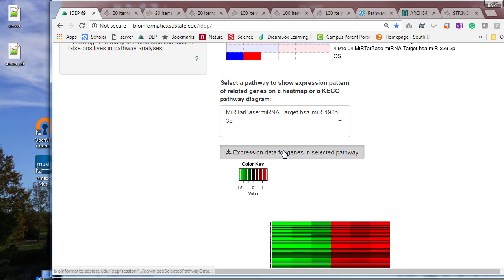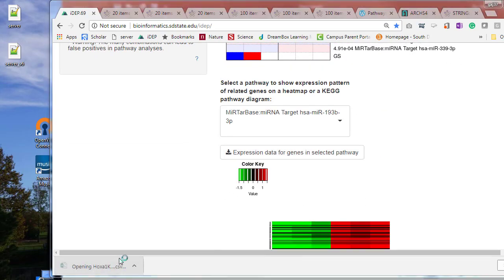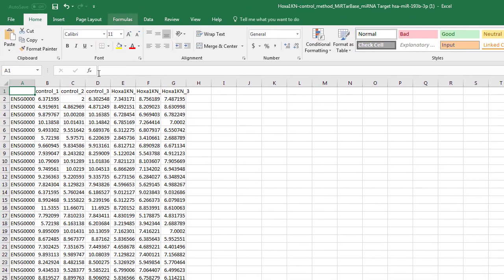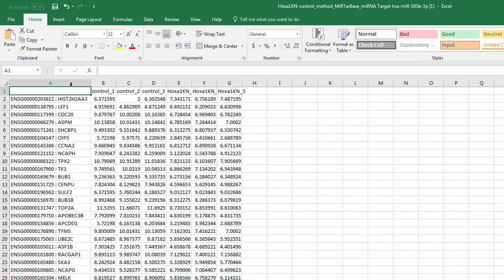If we download this, we can see the data behind that heat map.